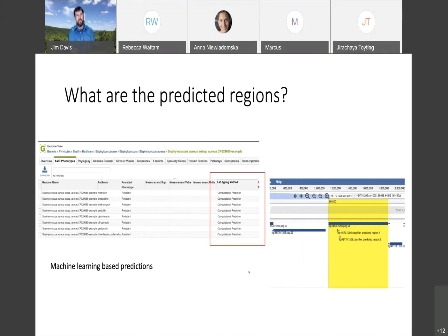Somewhere deep in the functionality of the command line interface, I think that it's possible to do this either at PATRIC or RAST, because people have asked that question before, but I don't know the answer offhand. And I actually don't know if the little stub of code that did that is still alive and visible in a place where we could point him. So offhand, I would have to say no.